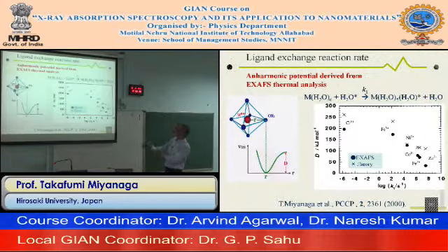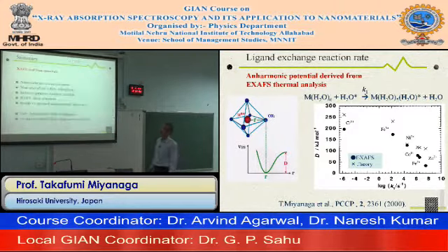This is the last topic, the application of EXAFS thermal factors to determine such bond potentials. We discussed in the first days the properties of nanomaterials. Finally, I summarize these 6 lectures.